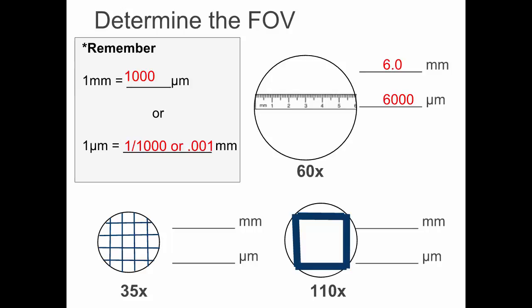Today we are going to be looking at some millimeter graph paper under the microscope. Millimeter graph paper is called millimeter graph paper because between each line it's 1 millimeter in length. So if I were looking at some millimeter graph paper under the microscope, how wide is the diameter of that field of view? Raise your hand, please. Julia? 6.